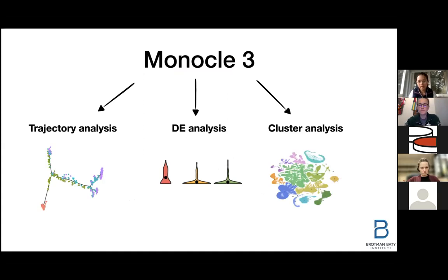So the three main things that Monocle 3 does are cluster analysis, differential expression analysis, and trajectory analysis. And today we're going to focus on the cluster analysis. And in the first half of next year, I'm going to have 2 more tutorials that'll continue from cluster analysis into differential expression analysis methods and trajectory analysis as well. So if you continue to follow this series of tutorials, you're going to have one step up each time you attend a tutorial and learn something a little more complicated than the first time.